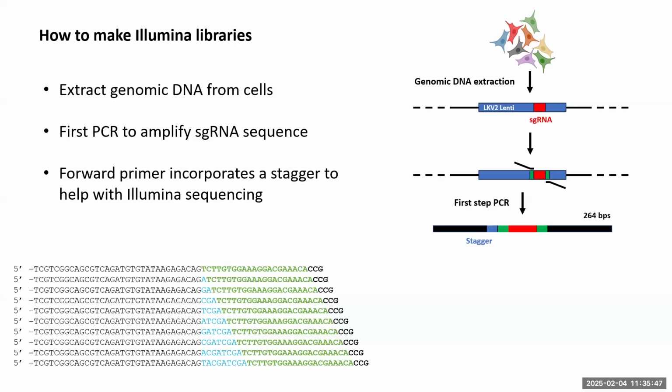Yeah. And in the protocol, they've got that about the primers. It ends up, primer cost is actually a wee bit to take into consideration when you're doing these, because when you generate the different primers that are quite large, as well as your reverse and the second primer sets, it gets a bit spendy.